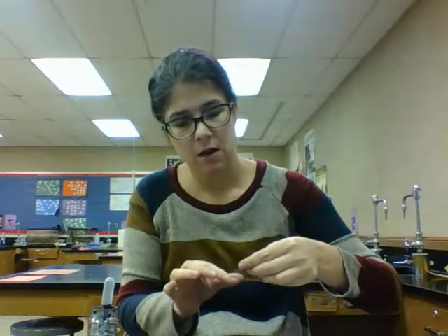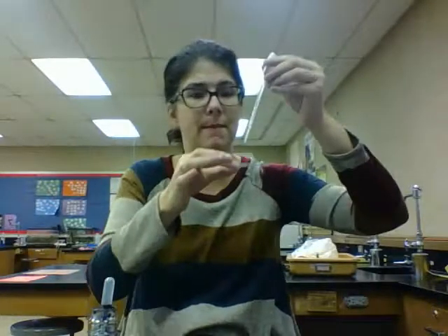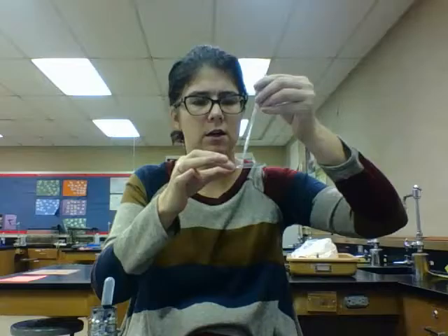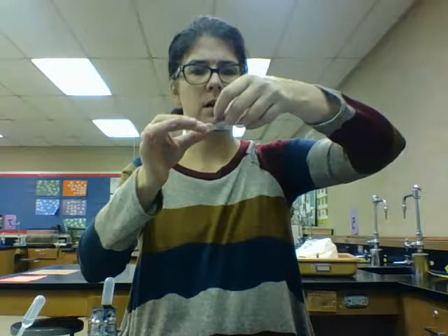So to stain it, you still start the same way. You still have a slide. I already put a little piece of carrot on there, a little baby carrot. Since it's not a liquid, I make my wet mount by adding some water to it. And I take my cover slip, 45-degree angle, let it drop, and now I'm ready to stain it.